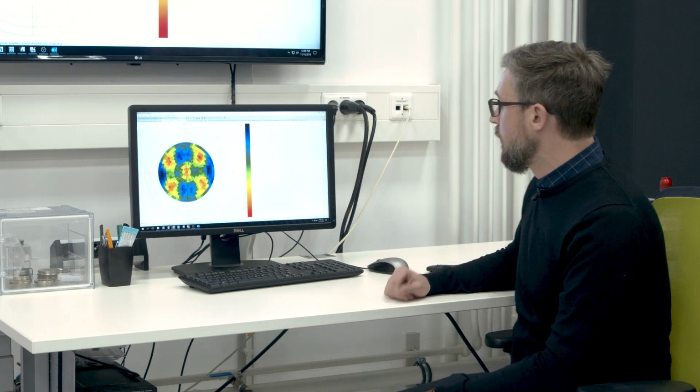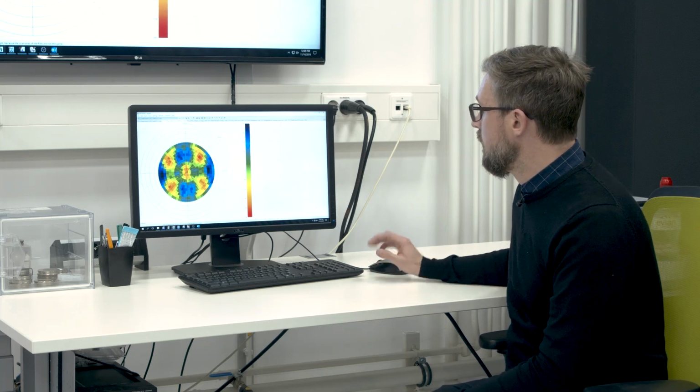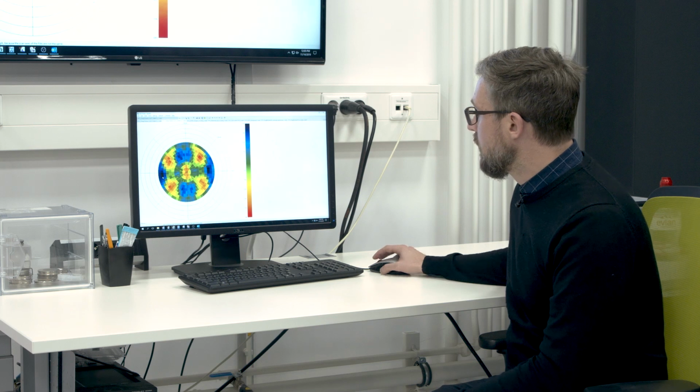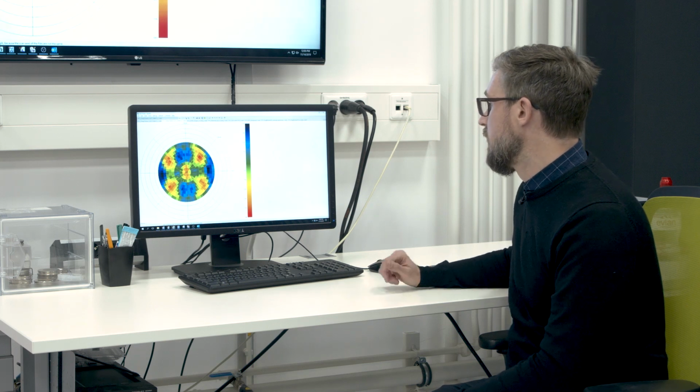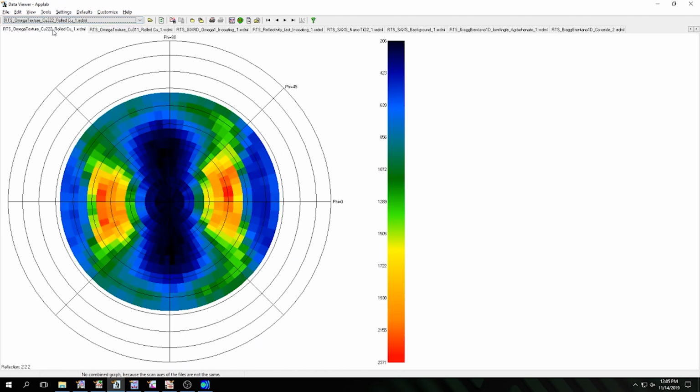Then we have the pole figures for the rolled copper that was collected afterwards, where you can nicely see the preferential orientation of the individual crystallites due to the rolling. And this is the example for the 311 reflection of copper. And also here I have the result of the 222 reflection, where you can nicely see the symmetric features that result from the rolling of the metal.